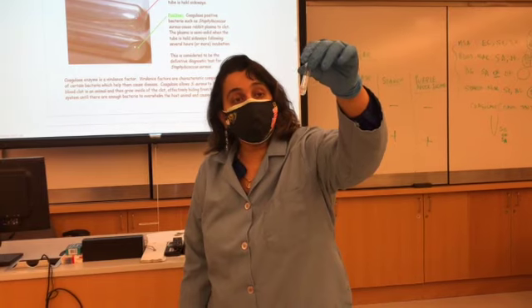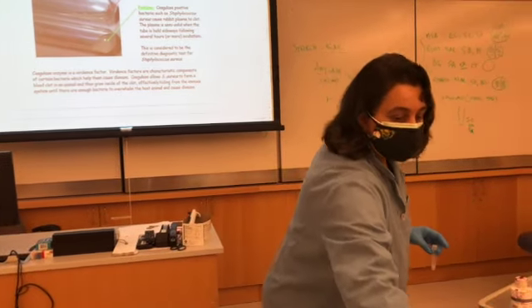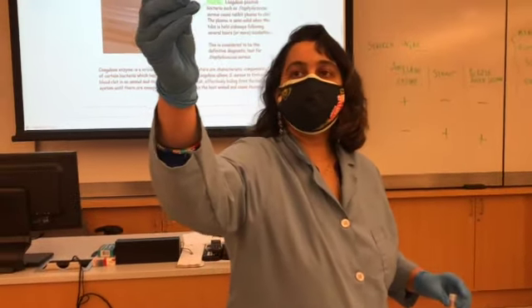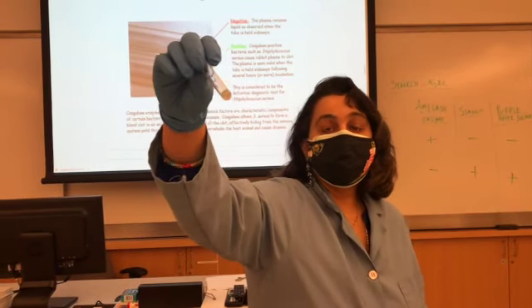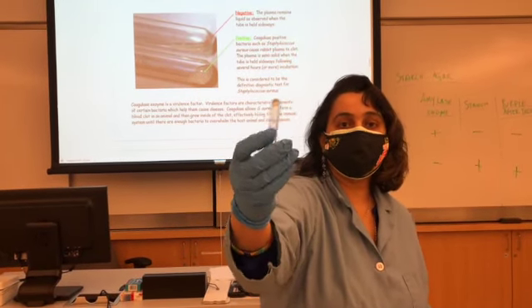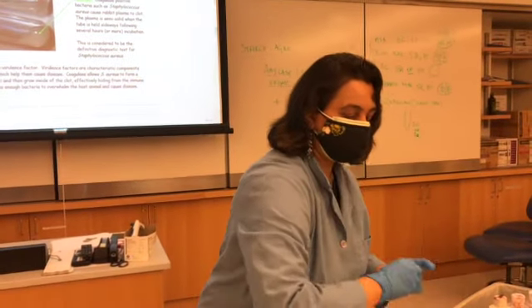After we add Staph aureus and incubate this for 24 to 48 hours, you expect this. See, this is after we added Staph aureus. It's completely solidified. Staph aureus has the coagulase enzyme and it clotted the rabbit plasma.